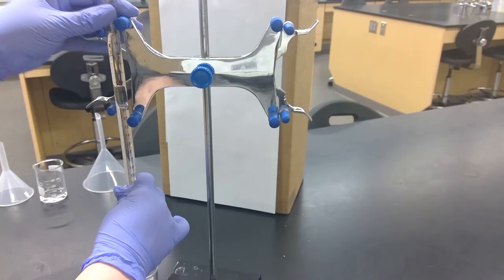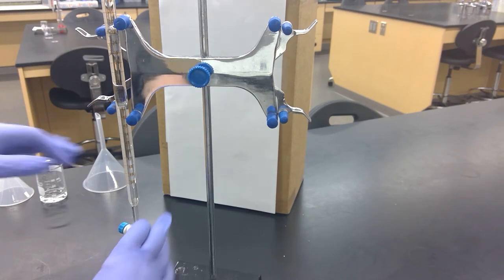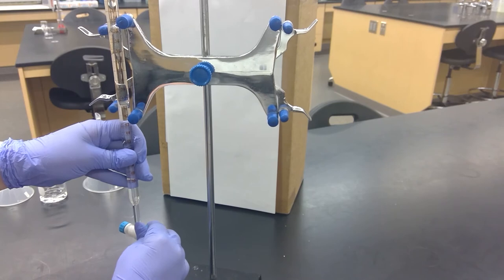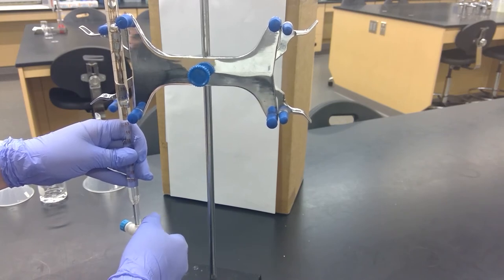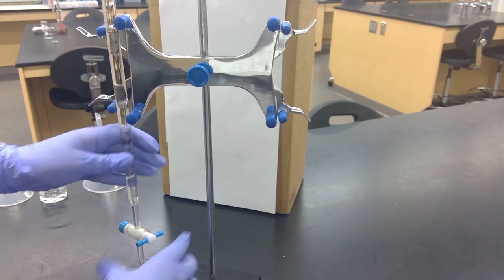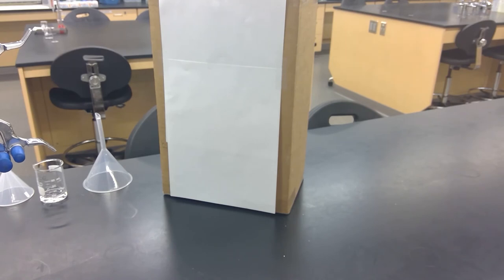Now you should have two data points. We'll have to do this three more times. Now we're slightly past 12 mils, so we will go to around 16-ish mils. Record the final volume on your burette again.